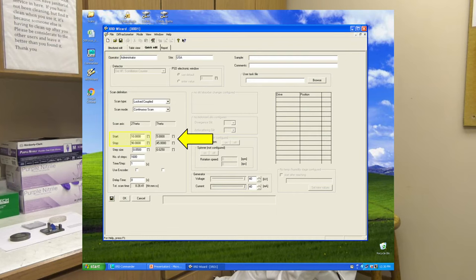The user can set the two theta scan range, step size or number of steps per scan, and time per step. The X-ray generator power for the scan can be adjusted up to 40 kilovolts and 40 milliamps.